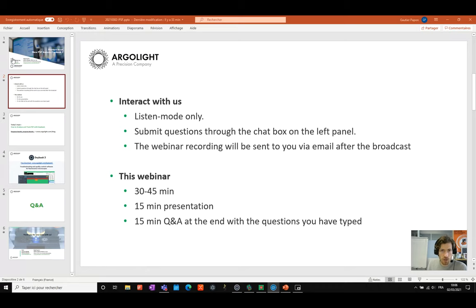I will talk about all the questions related to the software. However, I am not an expert in PSF. I don't have first-hand experience doing PSF every day in a core imaging facility. That is why I asked Dr. Dietzel to join me and answer your technical questions about PSF and about doing PSF on a regular basis for quality control. I would like also to say that Dr. Dietzel is not here to endorse our software, but to share his experience, opinion and advice about PSF as a quality control tool.